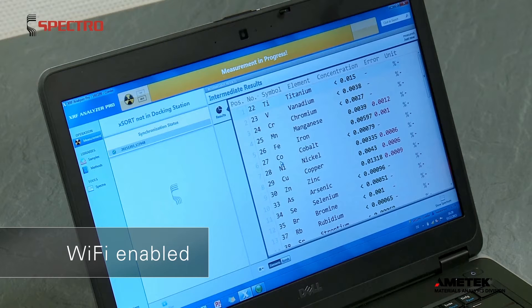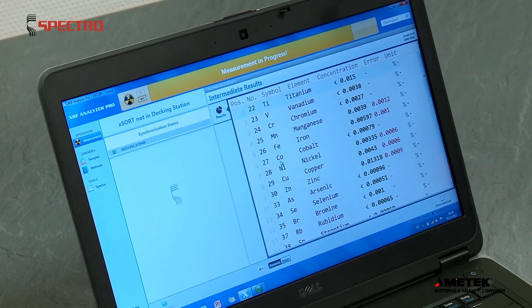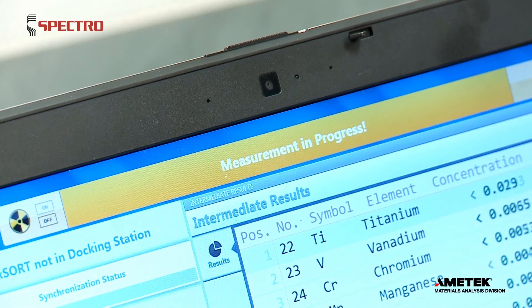XSort's Wi-Fi capability enables wireless connectivity with your laptop or Wi-Fi network. View results on the handheld display or on your laptop with XRF Analyzer Pro software.